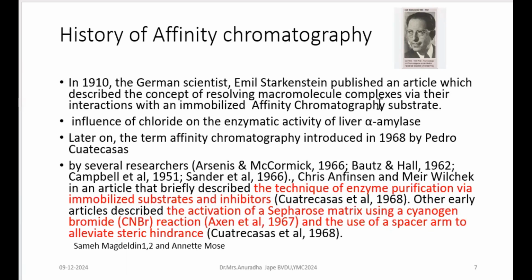Of course, the term affinity chromatography wasn't coined by them. It was introduced later, almost 50 to 60 years after, that is in 1968. In between, a lot of research took place and the technique advanced. For example, the technique of enzyme purification via immobilized substrates and using inhibitors. Substrate analogs and inhibitors, you know these terms with reference to enzymes. So, this was explored.